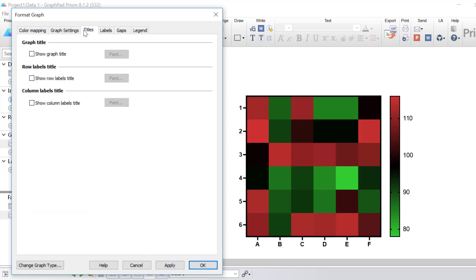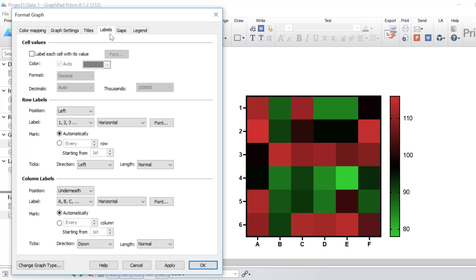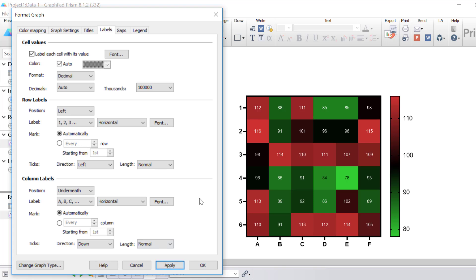In the next tab, you can choose to show the graph title as well as the row and column labels. In the Labels tab, the first option is cell values — you can select to have the values shown within each cell of the heatmap. A useful feature is that Prism will colour the labels so they contrast well and are easy to read. For example, darkly coloured cells such as black ones have white font, while lightly coloured cells such as green ones have dark font, allowing the reader to easily read the values.